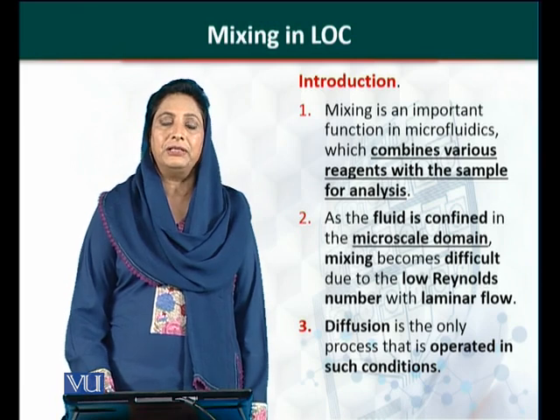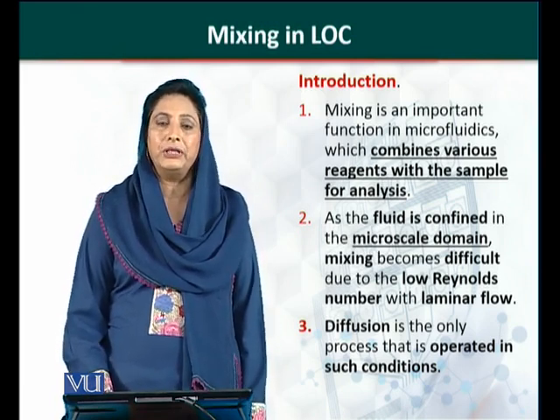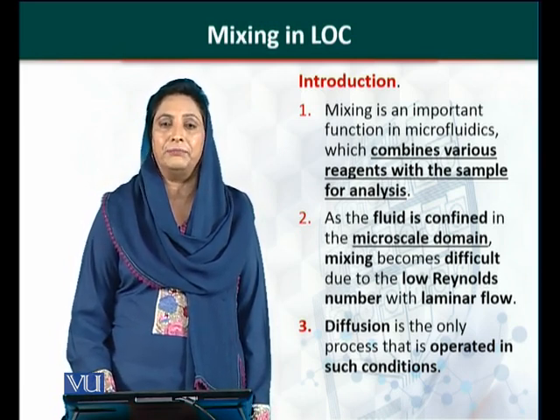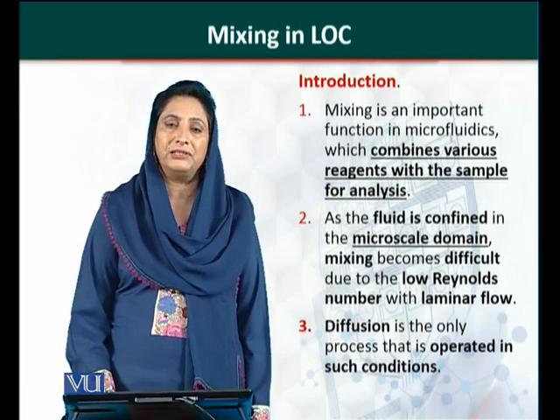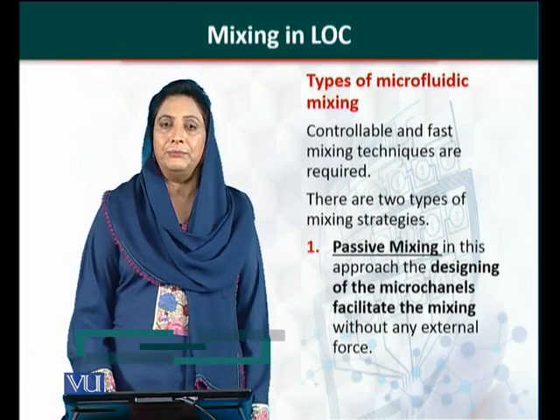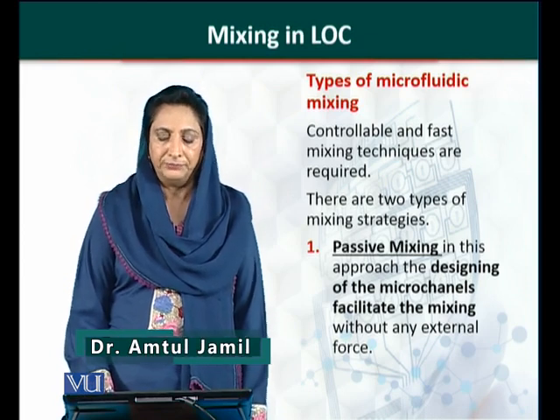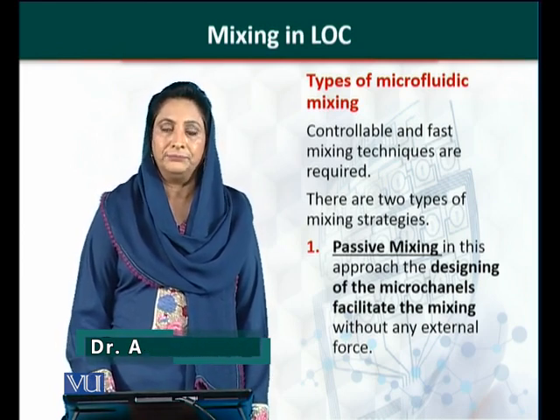The Reynolds number is low and the flow is laminar. So there is very little or rather no mixing of the reagent and the sample. The only force which is acting during this process is diffusion. Now, how can we increase the mixing in lab-on-chip technology? The mixing should be controllable and fast.